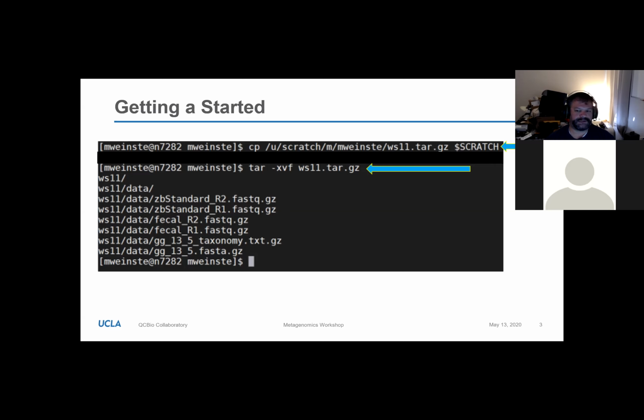Okay, so the cd command is going to be cd and then $SCRATCH. So this $SCRATCH right here, where it's $ and then SCRATCH in all caps, you're just going to cd into this folder. And on the command prompt, that's the fastest way to get into your scratch folder.